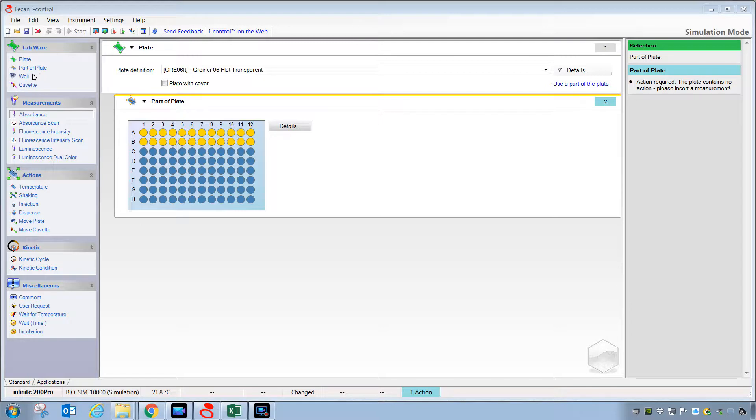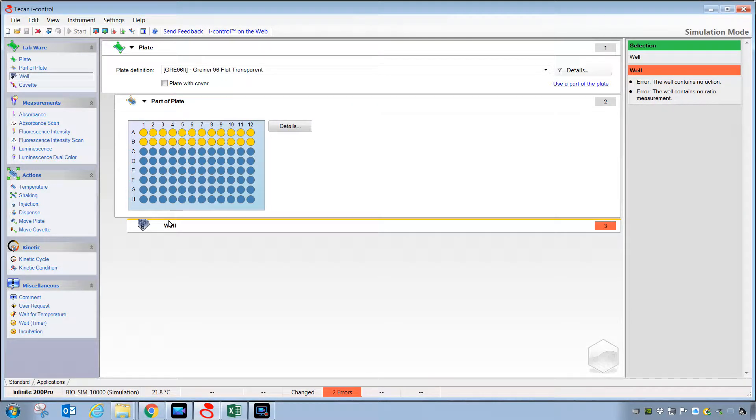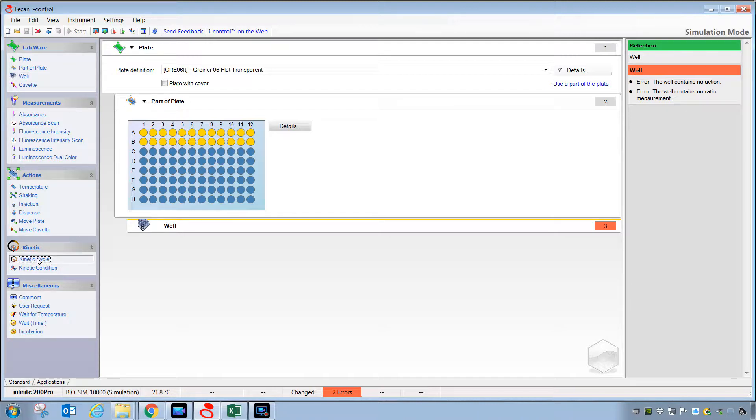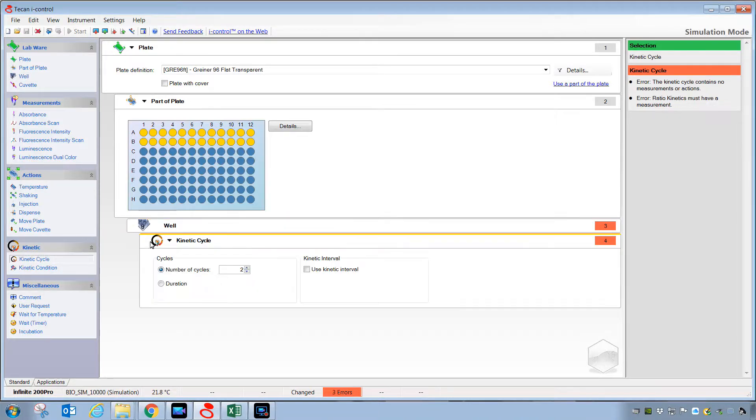Then, under the labware setting, grab and deposit a well strip here in the screen. From there, grab the kinetic cycle strip and place it beneath the well strip.